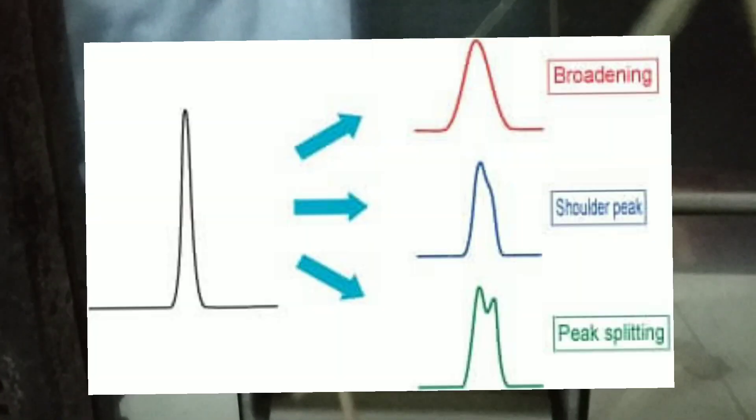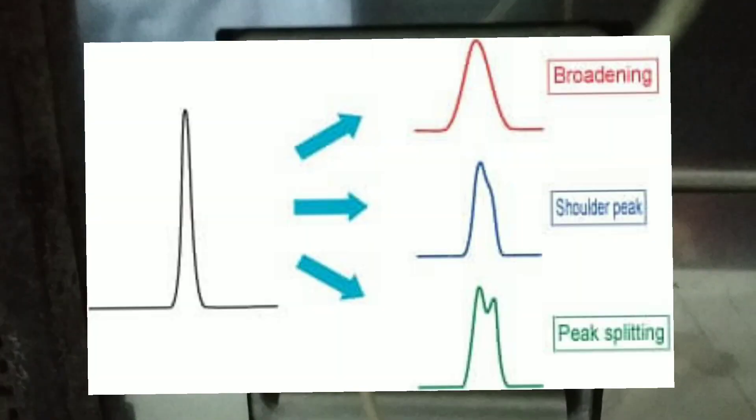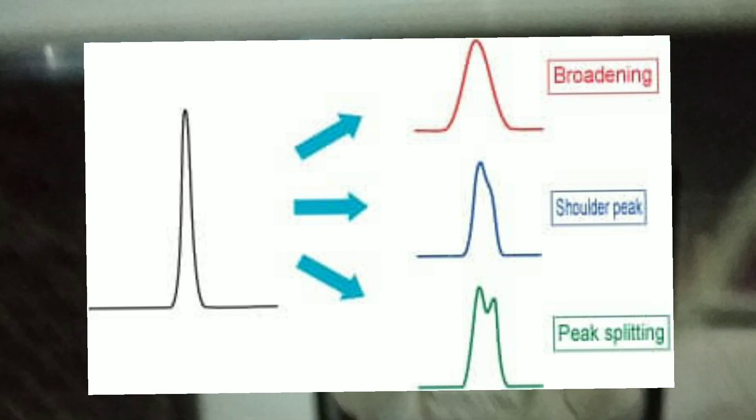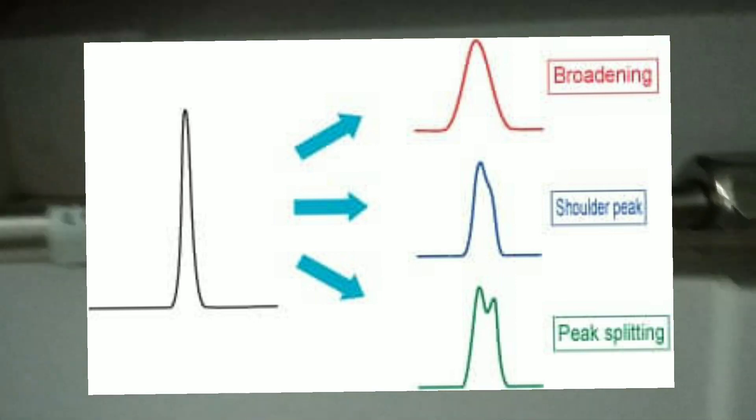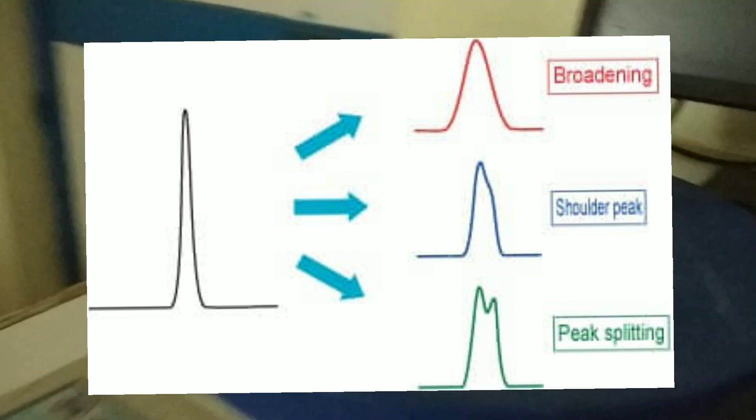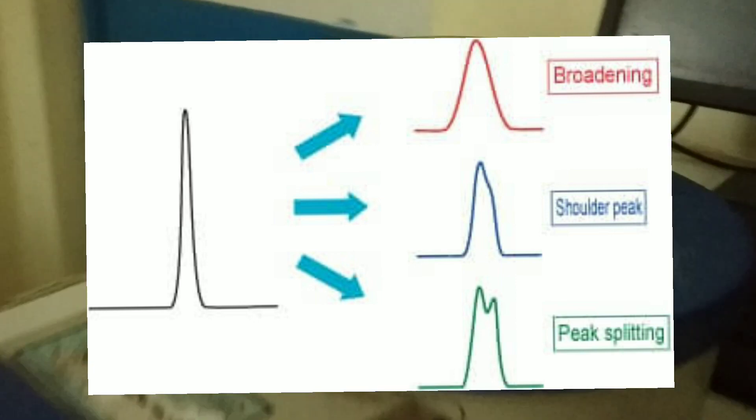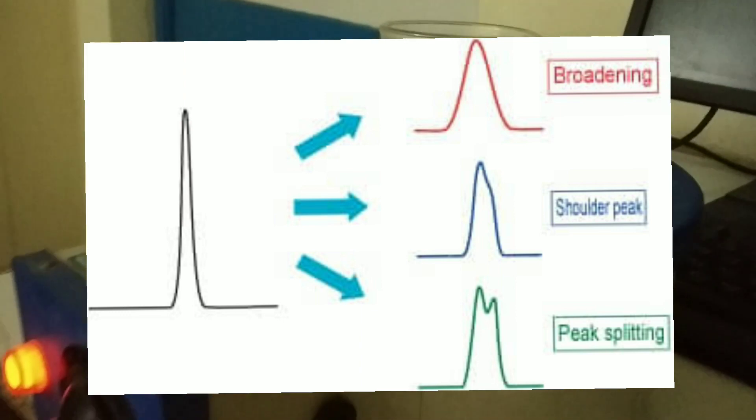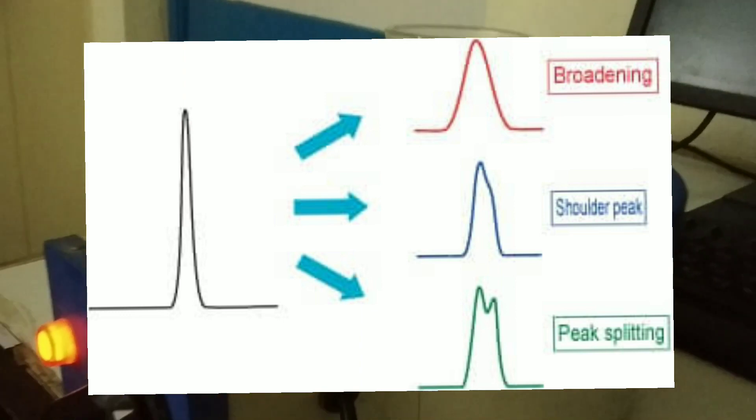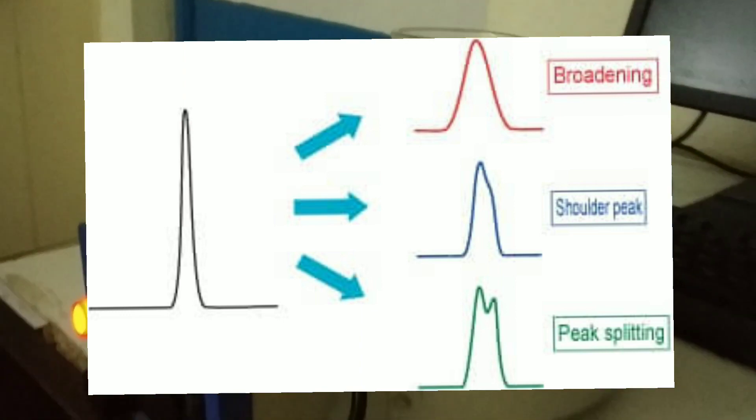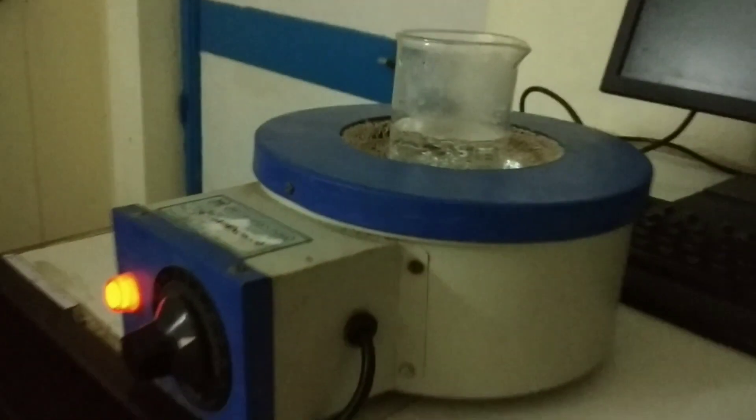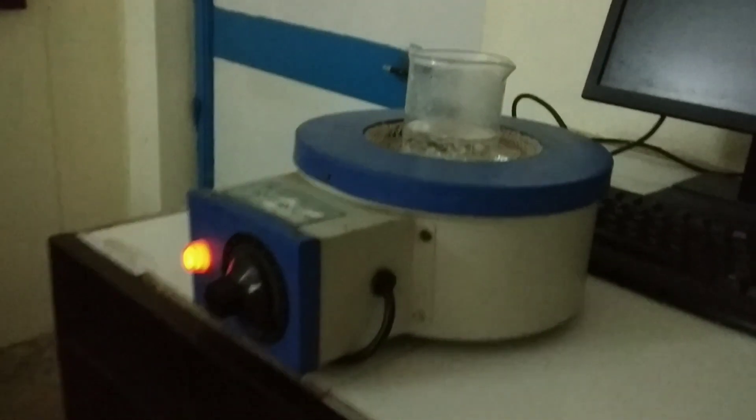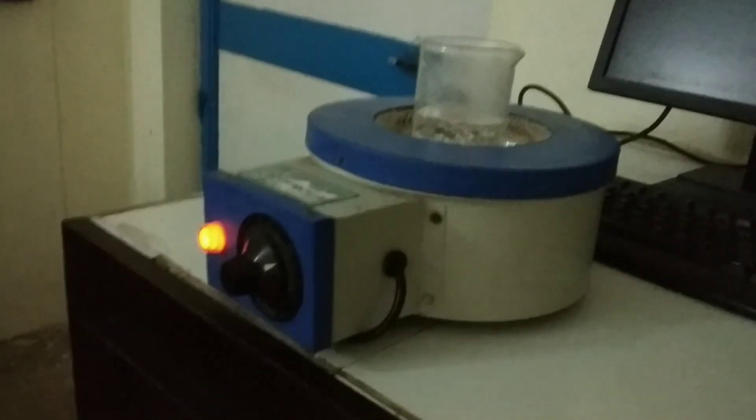It might be time to flush the column when you are seeing high back pressure, low efficiency, or high split peaks along with the most common issue which is particulate buildup at the head of the column. Reverse flushing your column can be done by the following simple steps which I'm going to show you.